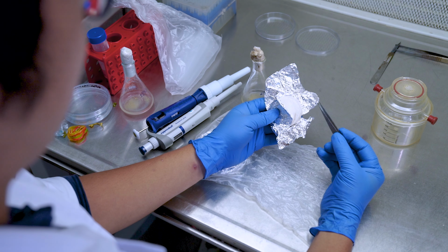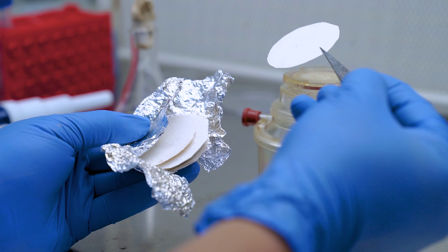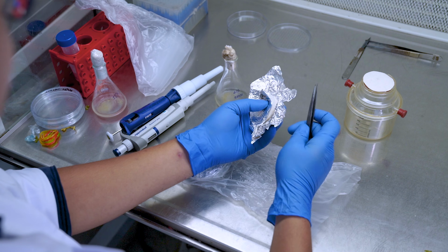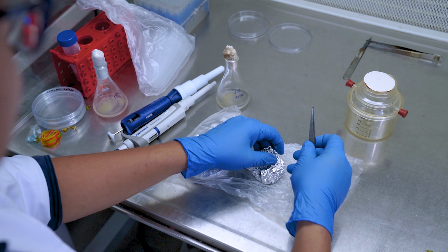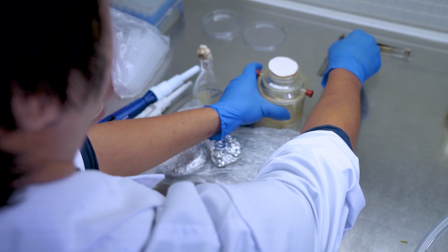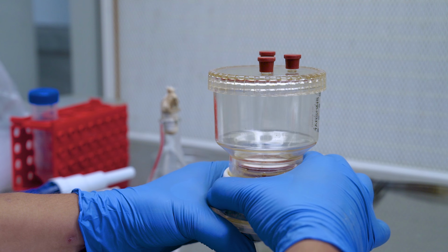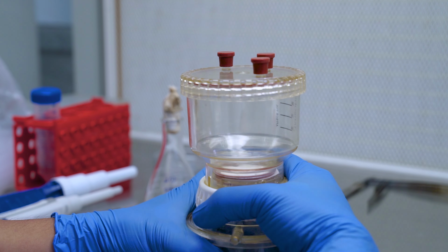Right now I am preparing for the infection of the ECS. For this we will be using the vacuum method. Now I am placing the filter paper where the cells will be collected once the vacuum is applied, which will remove all the excess media, and only the cells will remain on the filter paper. Then we will transfer the filter paper onto a co-cultivation media and keep it for around 2 days.